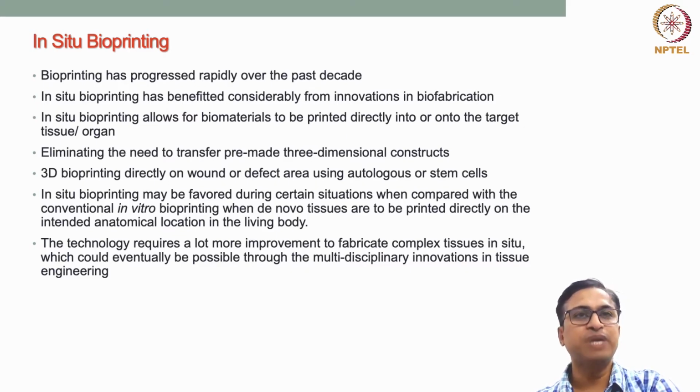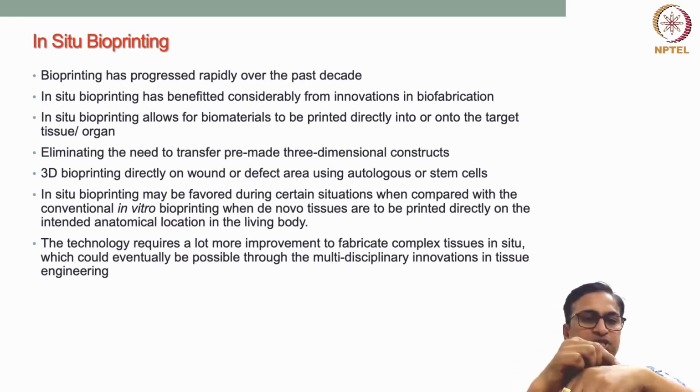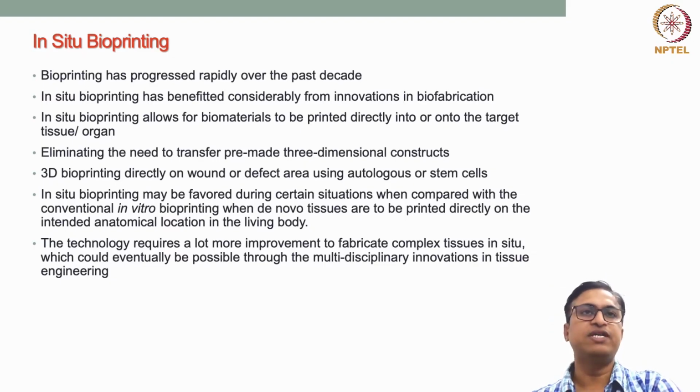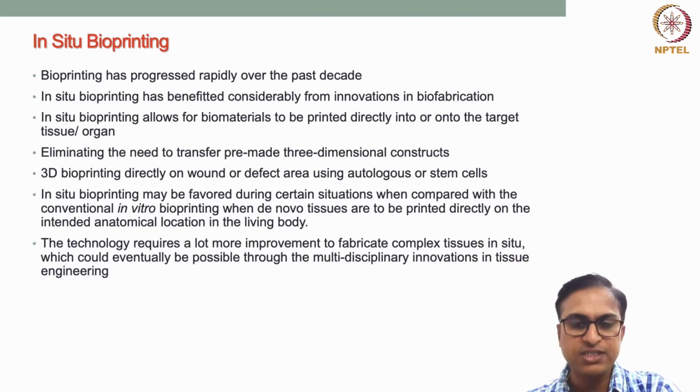But when we are actually printing the tissue construct directly on the wound bed, the deposited structure can conform to the uneven geometry of that patient's wound bed. So perfect fitting of the bioprinted construct to the wound bed is possible in this case, and that's a major advantage because there is no gap between the bioprinted construct and the wound bed. That definitely helps in better tissue regeneration.